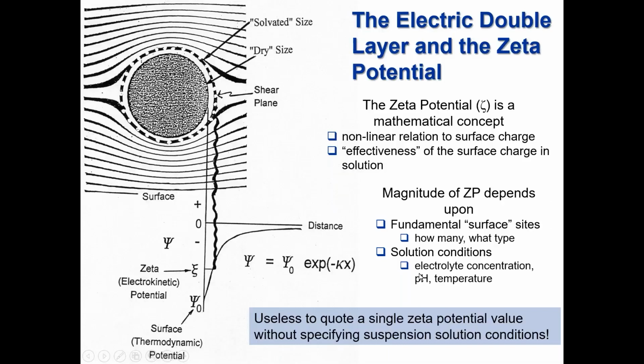The liquid molecules adsorbed at the interface have fewer degrees of rotational and translational motion, and ions and other moieties can be trapped. So we can see a solvated particle is different from a dry particle. By the way, this also explains why measurements of particle size using dynamic light scattering can often give results at odds with those from microscopy. If a particle moves, it takes this boundary layer with it. In reality, the thickness of this boundary layer is not well defined, which is why I show it as a sort of wavy line. The edge, however, on the outside edge is called the shear plane.